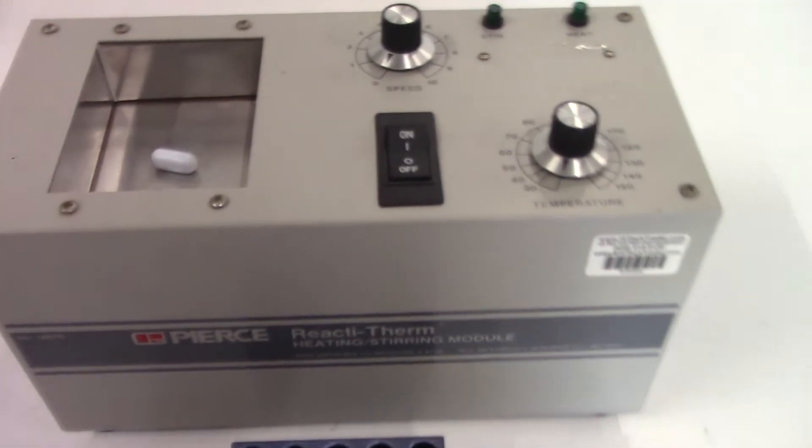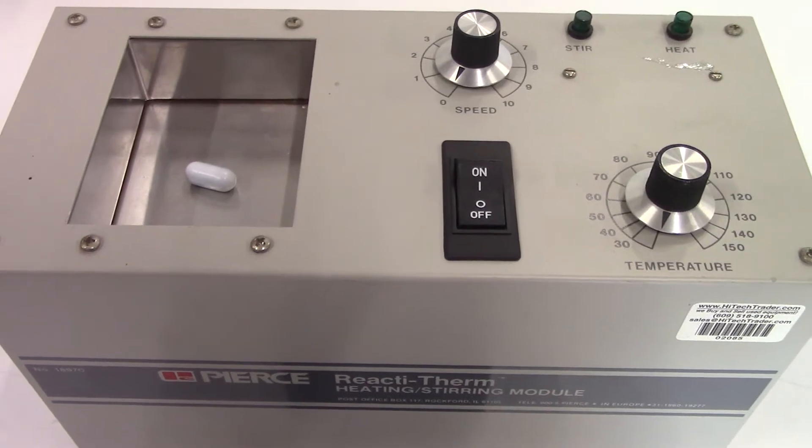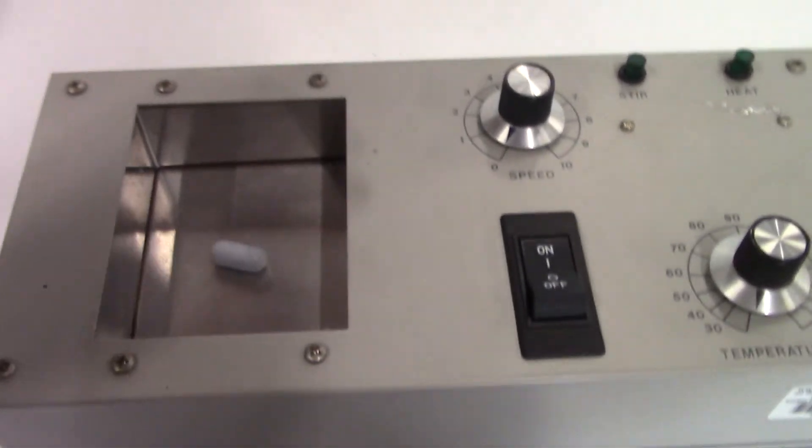I just want to show you how the unit is stirring. I'm going to turn the unit on and turn on the stir.